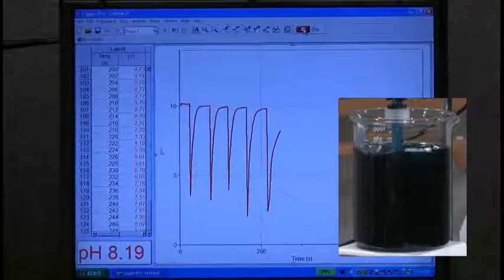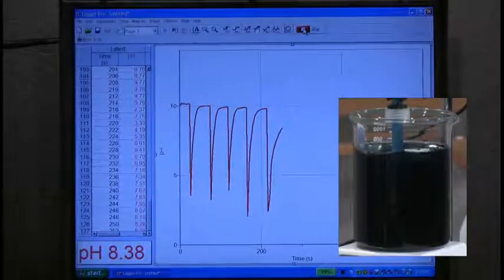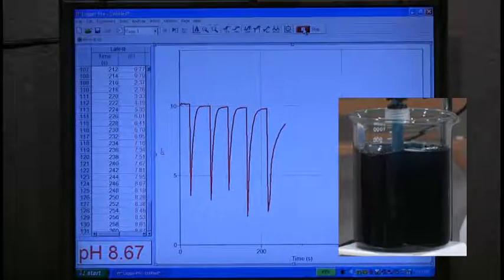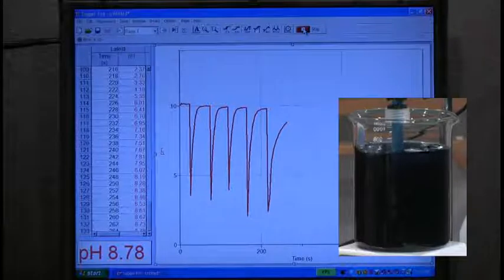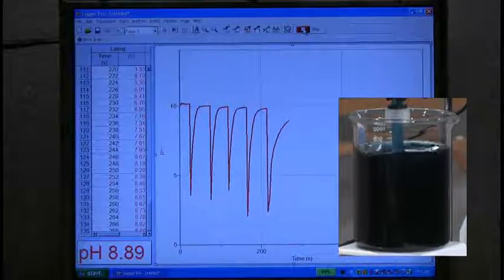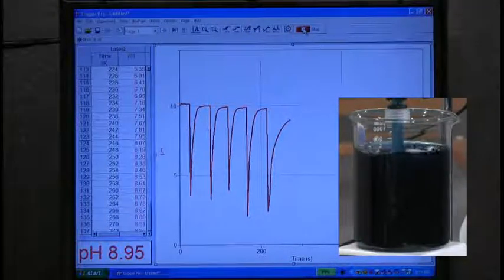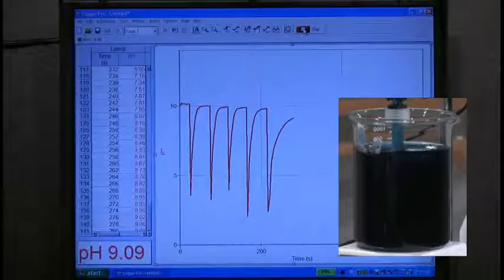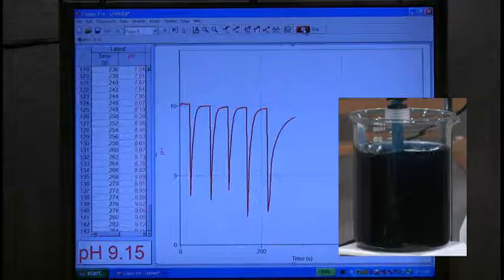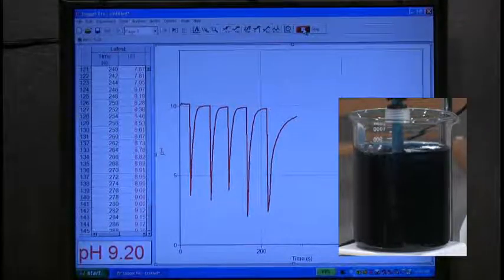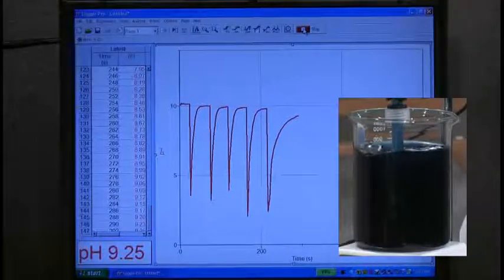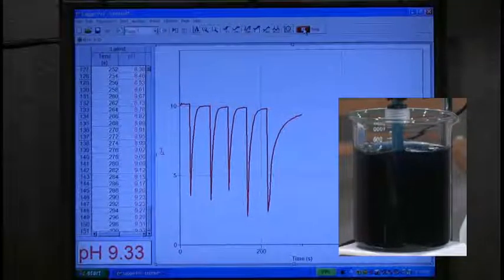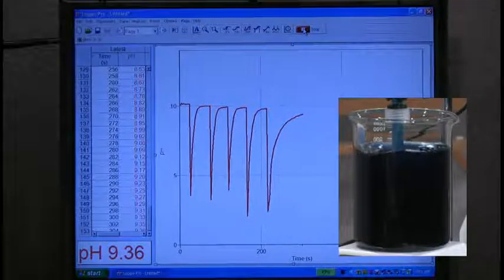What are we doing here, guys? Notice how the curve is rising more gently now. I'm right at equivalence point. I think we're getting about to the end. So, we're only getting up to about pH 9 so far. So, we've got a little bit of an excess of hydroxide, but not much. I'm watching for it to level off. Tell me this is the best I can do. And then I'm going to finish it.